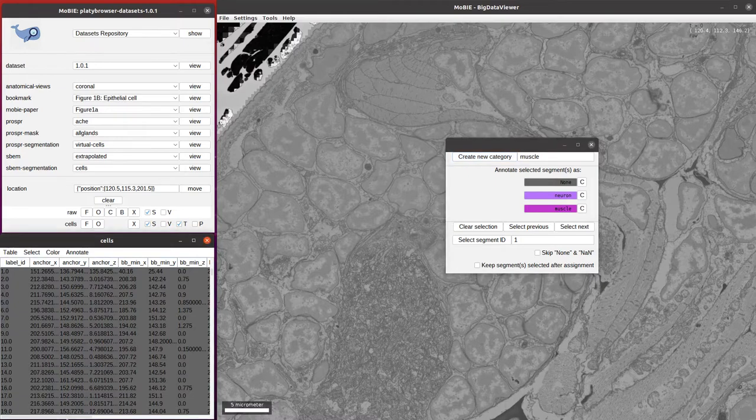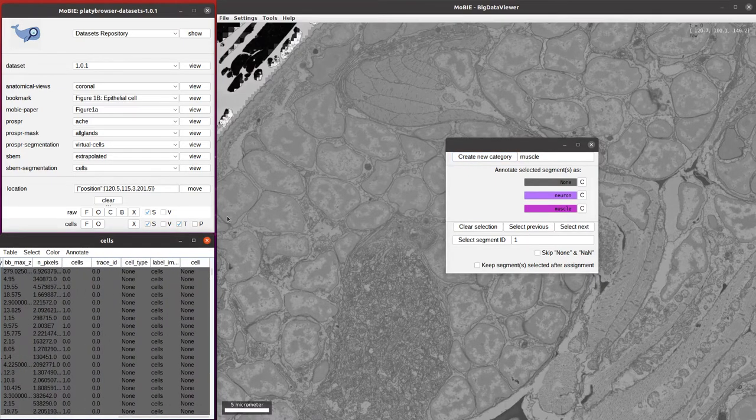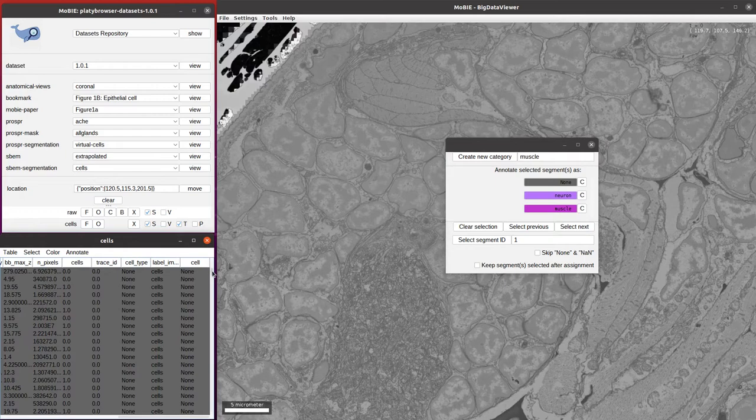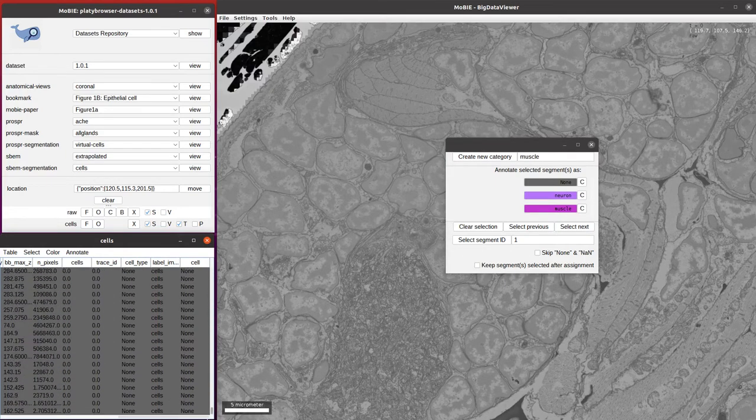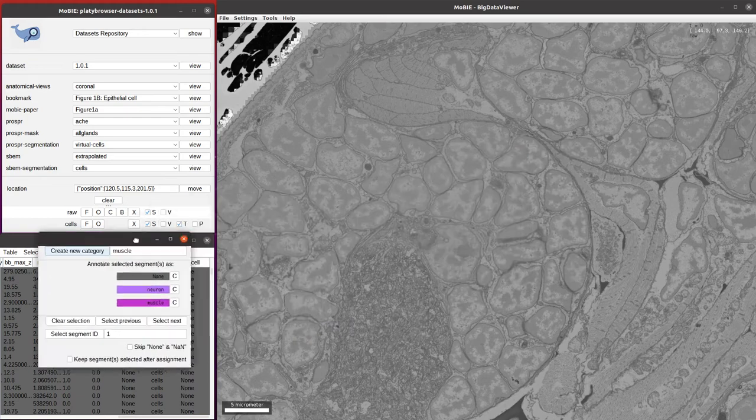Now if we go back to that table and scroll all the way to the right, we see it's made that new column for our annotations and everything currently is assigned none, because we haven't started the annotations yet.